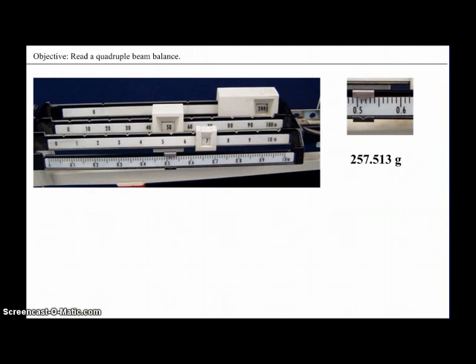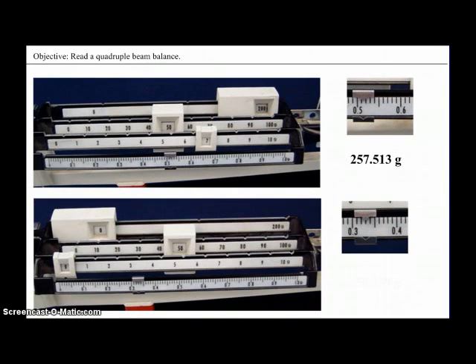Okay, one more. Did you say 50.339 grams? Excellent. You now know how to read a quadruple beam balance.